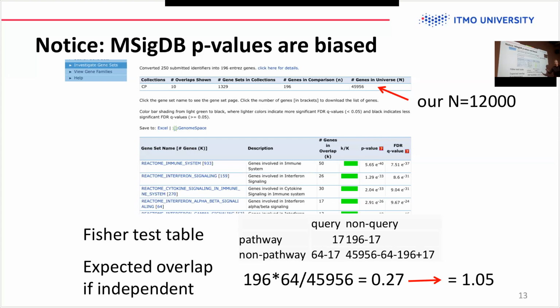So in this type of analysis, be aware of these kinds of problems. Usually, when you see a p-value of 10 to the minus 20 or even 10 to the minus 10, it doesn't matter. It still will be significant.